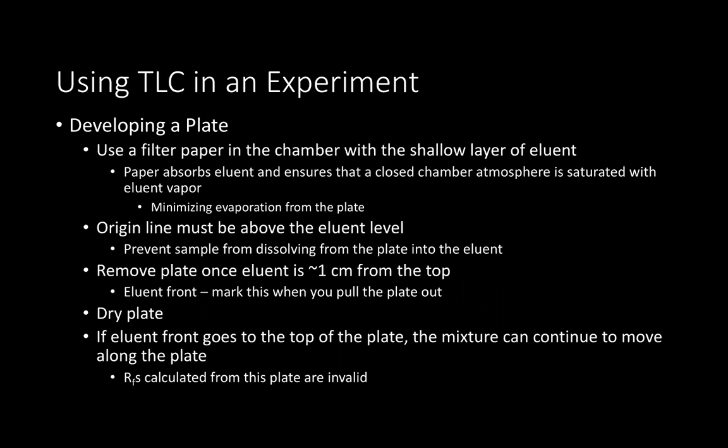Marking your eluent front is done once you pull the plate out. It is not an end goal finish line that you draw prior to putting your TLC plate into the chamber. After you've marked the eluent front, your wet plate needs to dry. If you've done your work, you know what the structures are of the solvents that we're using for this lab, and sometimes your solvent can actually interfere with your ability to visualize your TLC plate. So you want to make sure that your plate is nice and dry before moving on to the next stage of TLC.